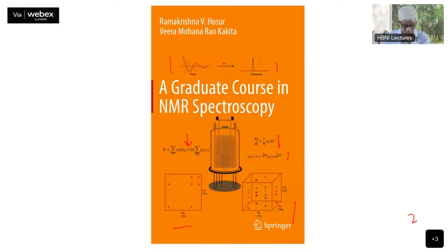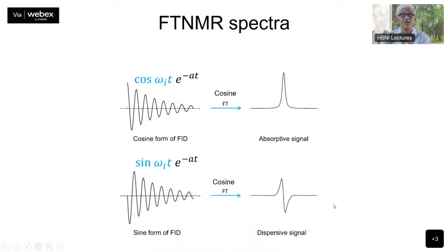Okay. So next. Okay. Just a recap of what you might already have seen in previous lectures. There is the first thing about the FT NMR spectrum. FT NMR actually laid the foundation for all the later developments, including multidimensional NMR spectroscopy. And here you have the basic concepts.